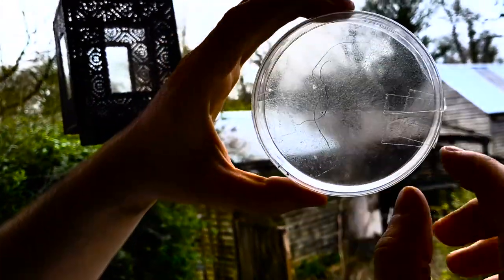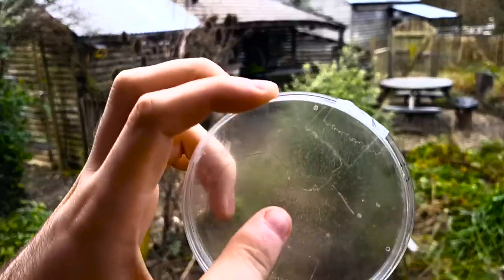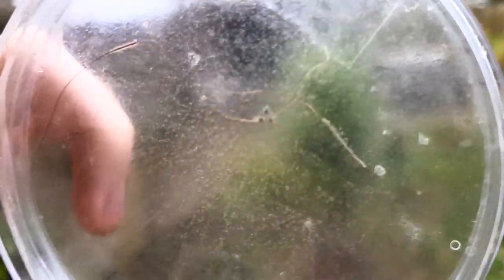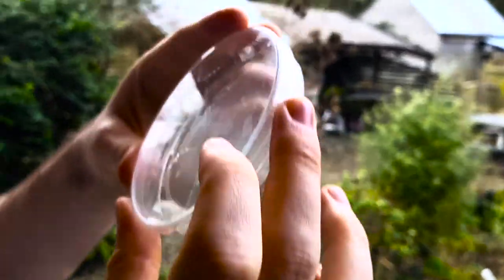So this is my beard. And if you look, oh my god, you can see that huge thing there. You can see where the hair is actually in contact with the agar. You've got these green dots, which is the epicenter. You can also see over here, there's a red line. Oh, Jake. It says Jake on it.